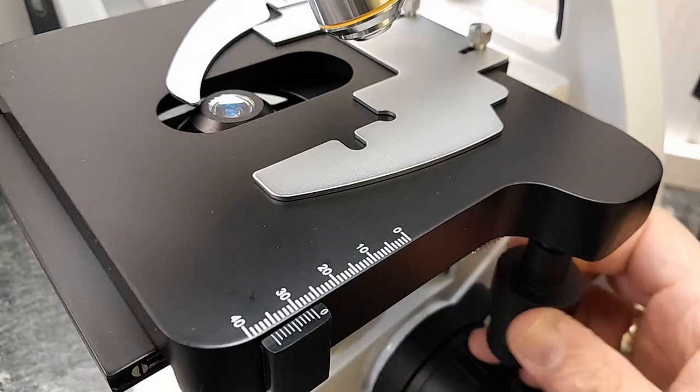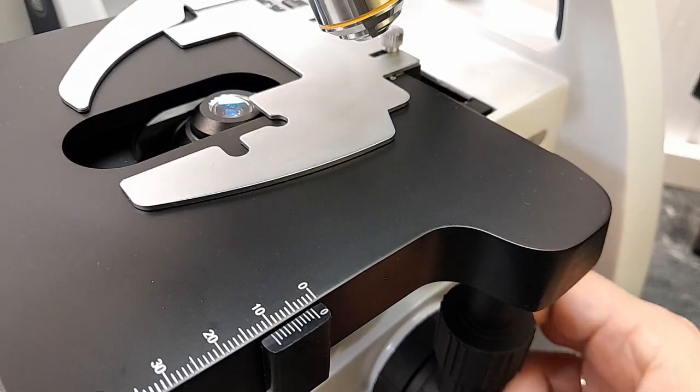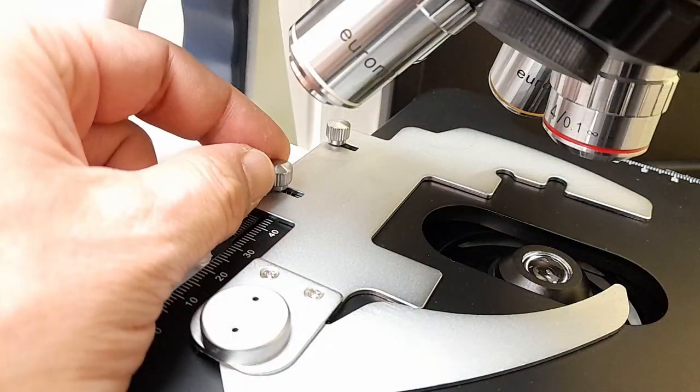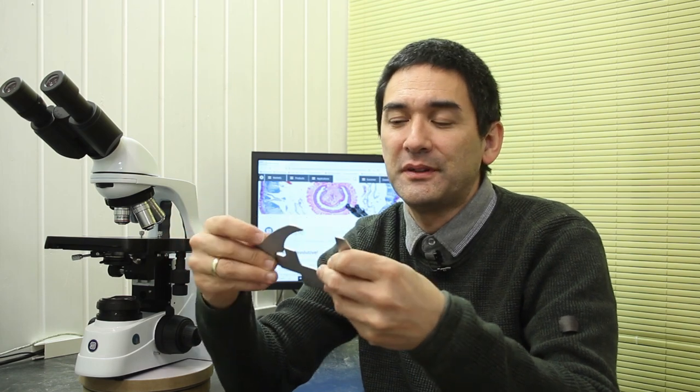Now let's have a closer look at the stage of this microscope. It is a so-called rackless stage, meaning if you turn the mechanical stage there are no protruding parts. By simply loosening the screws here you're able to take out the slide holder, which can be removed very quickly and easily for easy cleaning. It's very solidly made and quite high quality. The spring action is dampened, which gives it a little protection so that slides don't break if you snap it back.